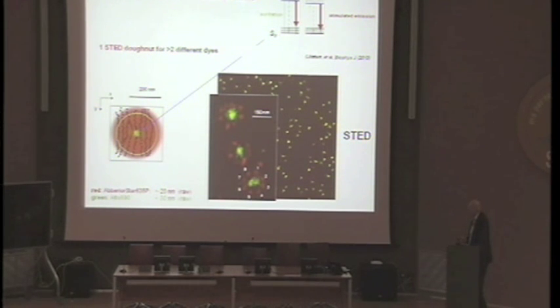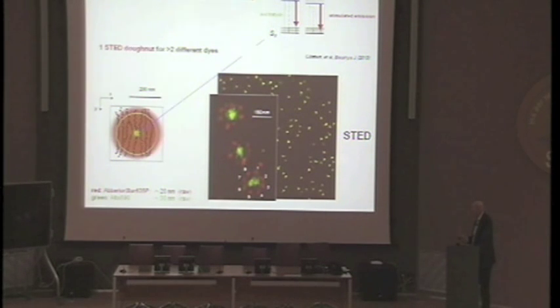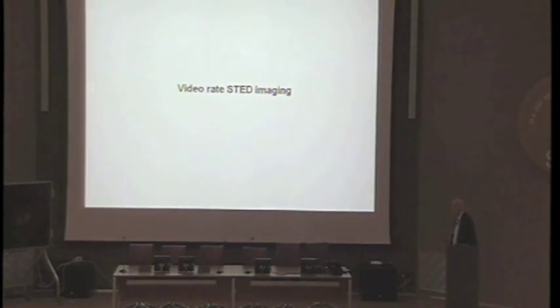And my group also synthesizes dyes that are very well suitable for the laser wavelengths that are available now. And you can colocalize things very nicely because you can be sure that the fluorescence must come from this region. There's no way out because here it's turned off with a single beam. And if it is 2 dyes or even 3 dyes, it must come from this region. So you have a perfect colocalization. This is also important. And you can tune the spatial resolution.